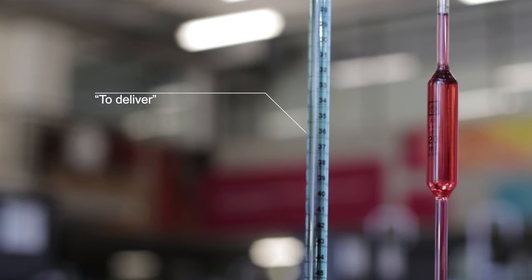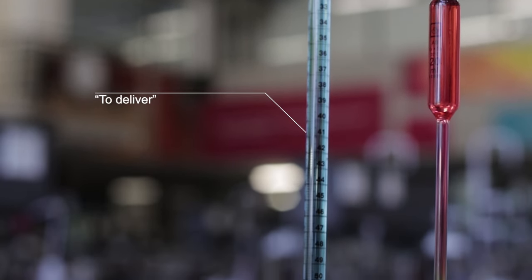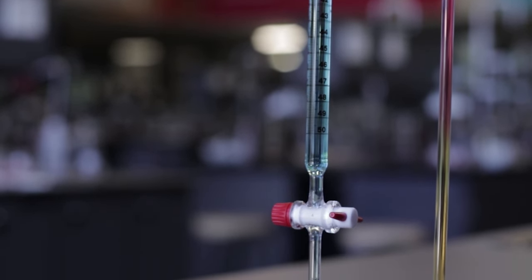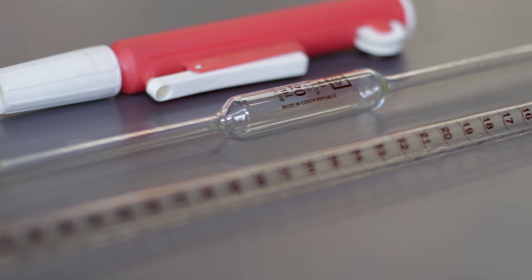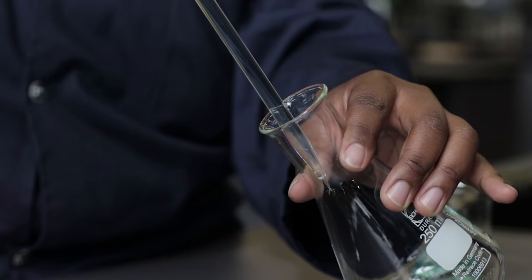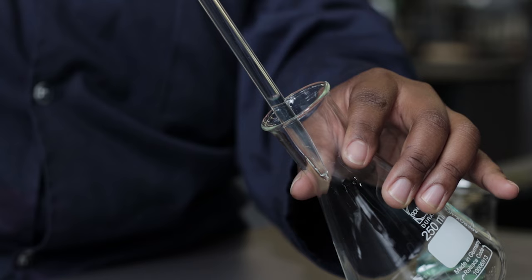The second type of glassware is classified as to deliver. To deliver glassware refers to glassware that is designed to deliver a precise volume. They are designed to contain a little more solution than the indicated volume so as to deliver the precise volume stated on the glassware. This is due to some of the liquids sticking to the sides of the glassware.